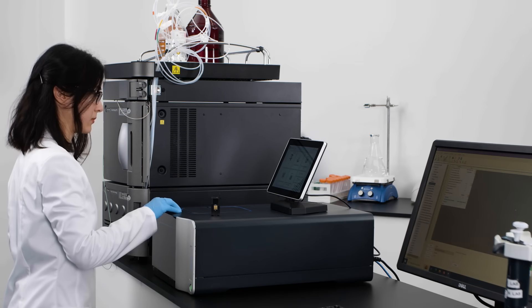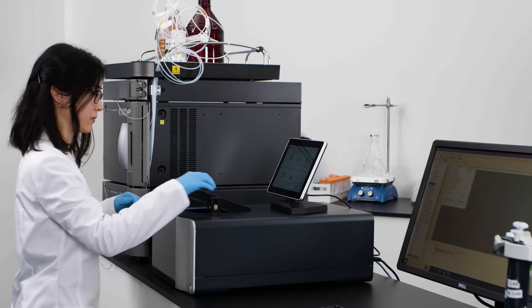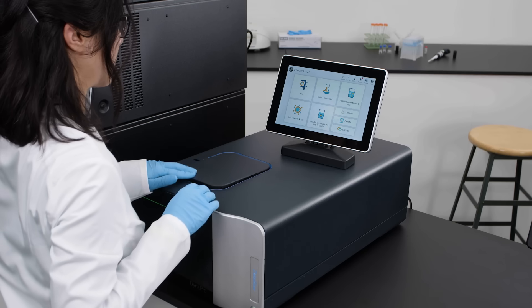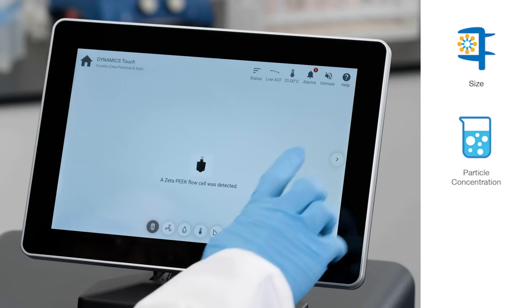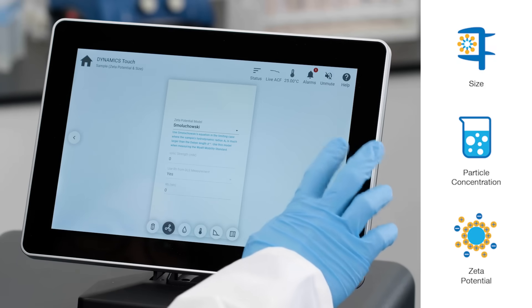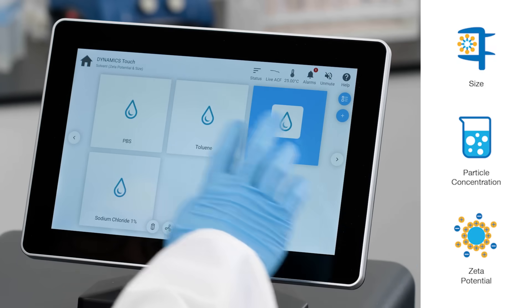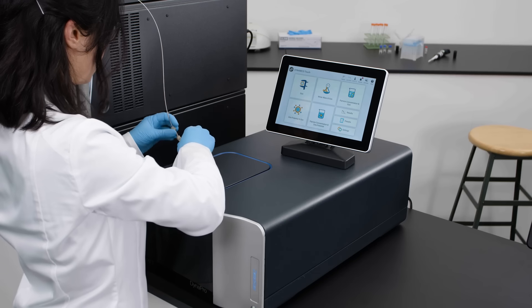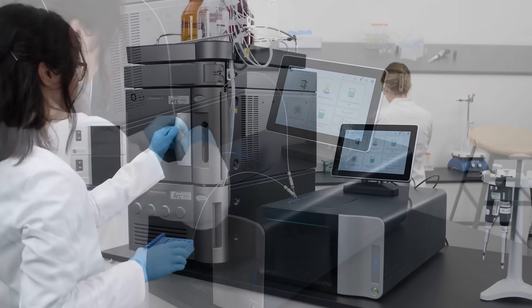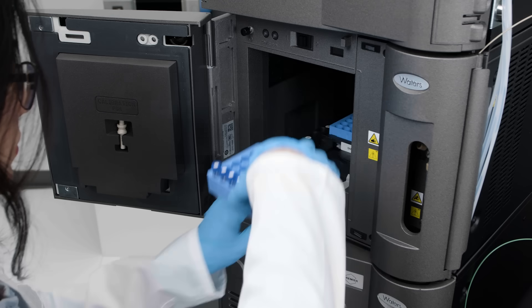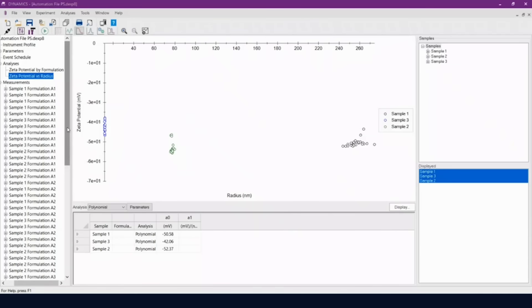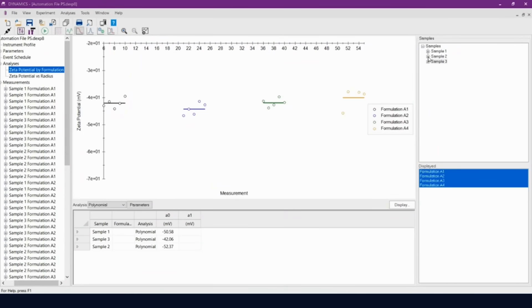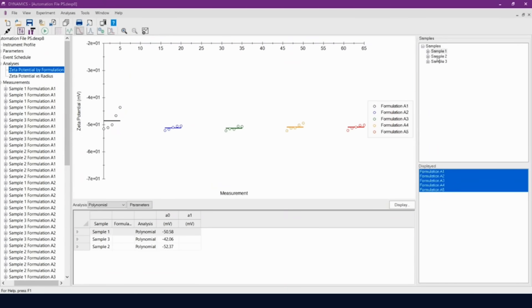What if you could walk up to a light-scattering instrument with only a few microliters of sample and measure size, particle concentration, and zeta potential in less than a minute? Or connect your instrument to an autosampler and schedule unattended measurements for dozens of samples, then automate analysis for a range of conditions to deliver the data needed to answer complex questions.